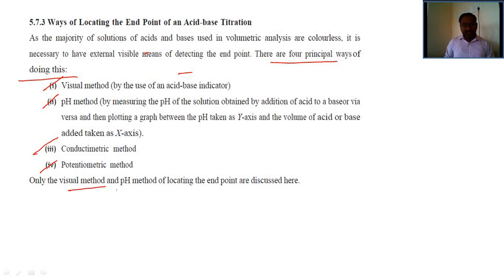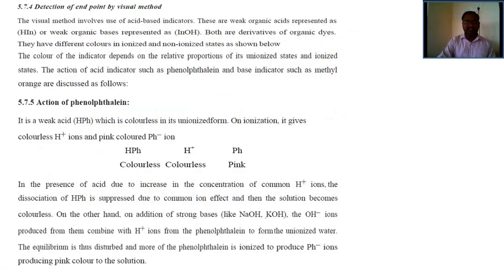Only the visual method and pH method of locating the endpoint are mentioned in the next slides. Detection of endpoint by visual method.